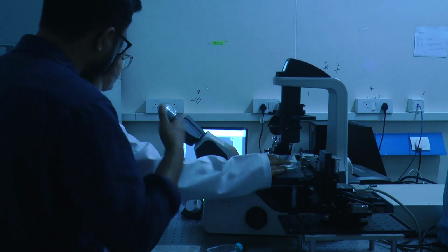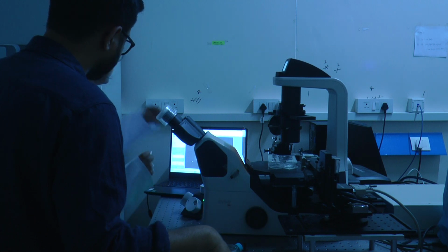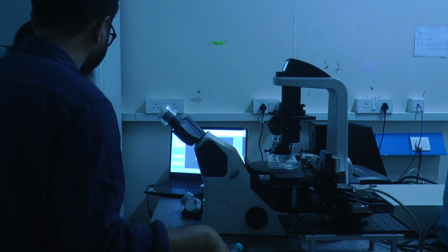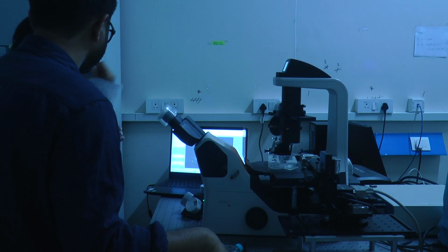What do you study on how to study? Then see, the cells, if I do it properly, like I deal with regular ones, very few cells will get detached. So they will basically remain attached to the surface. So I can just take out from that.